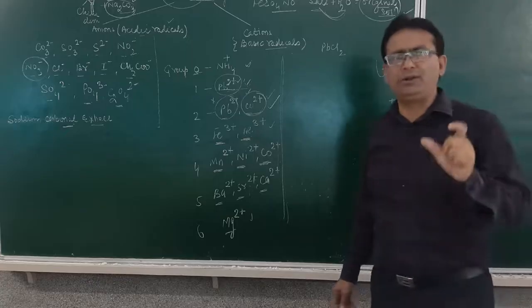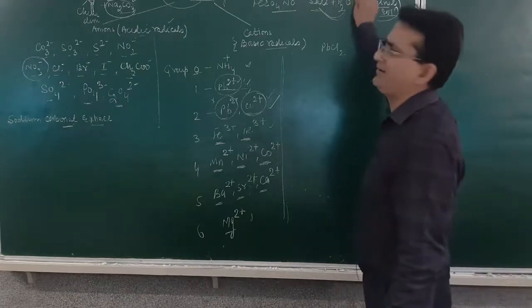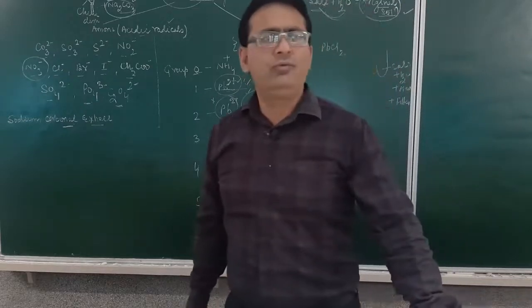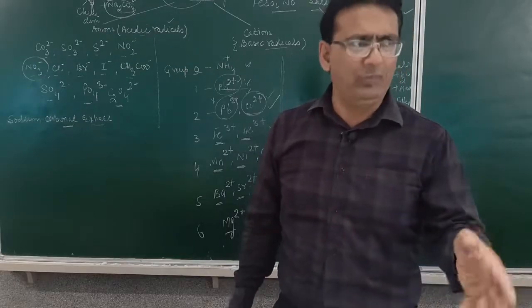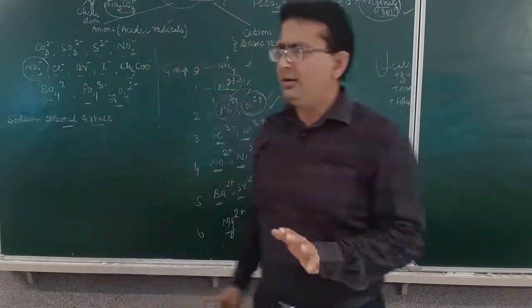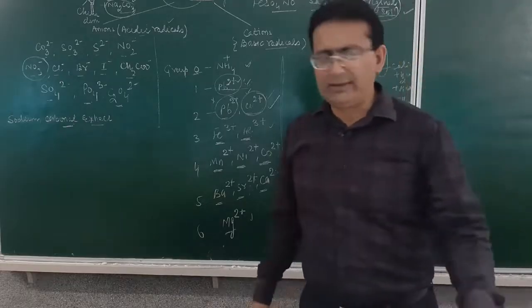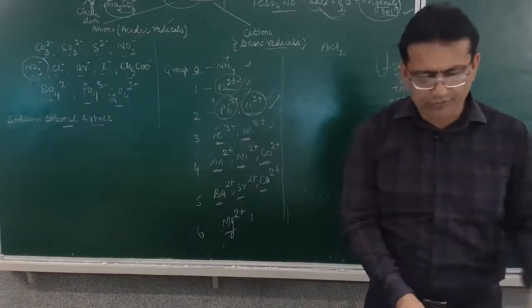You will be identifying these because you know this and will try to learn the procedure today. The main important thing is that you learn the procedure today. So today we have given you the nitrate salt. Am I clear or not? Now, one anion, nitrate, is given, which you are told, and you will be practicing for identification, mainly the procedure is to be learned today. Then one cation is given to you and that is of course lead. But then if you look at the next page, this is very important.